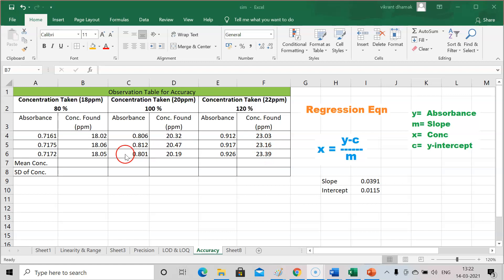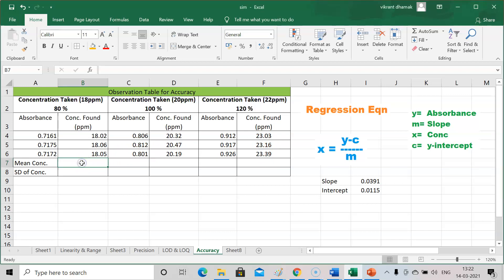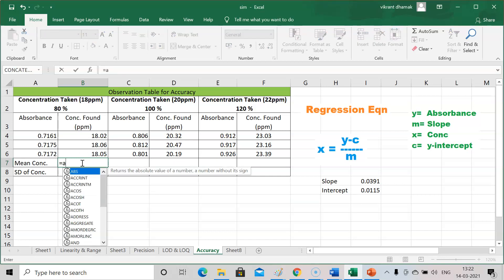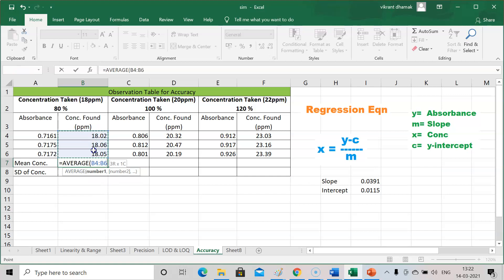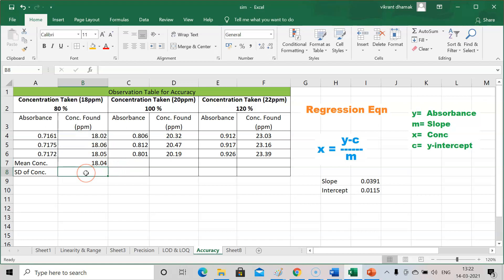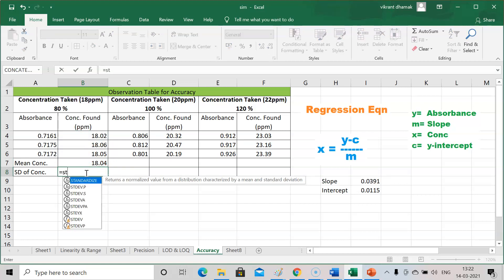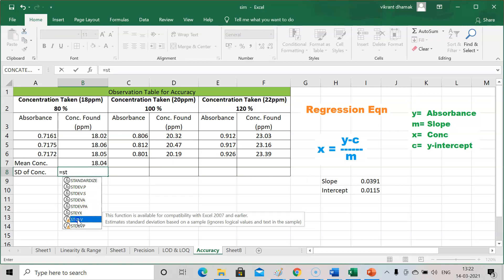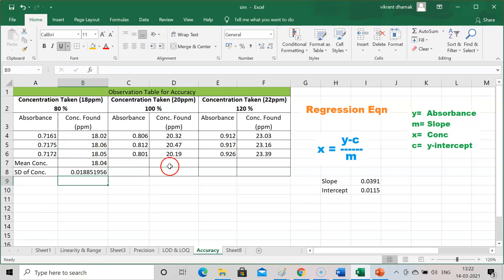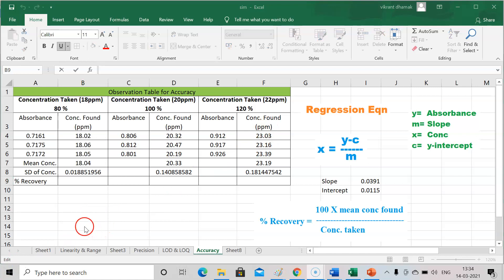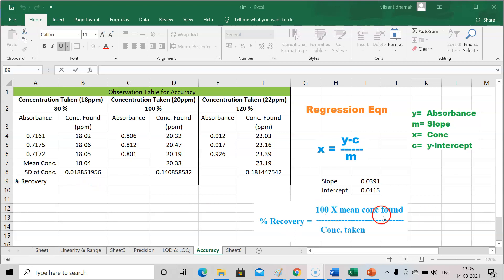After getting found concentrations, calculate the mean concentration using the AVERAGE function. For standard deviation, use the STDEV function and select the relevant cells. Calculate mean concentration and standard deviation similarly for 100% and 120% levels. To calculate percentage recovery, use the formula: % Recovery = 100 × (mean concentration found / concentration taken).